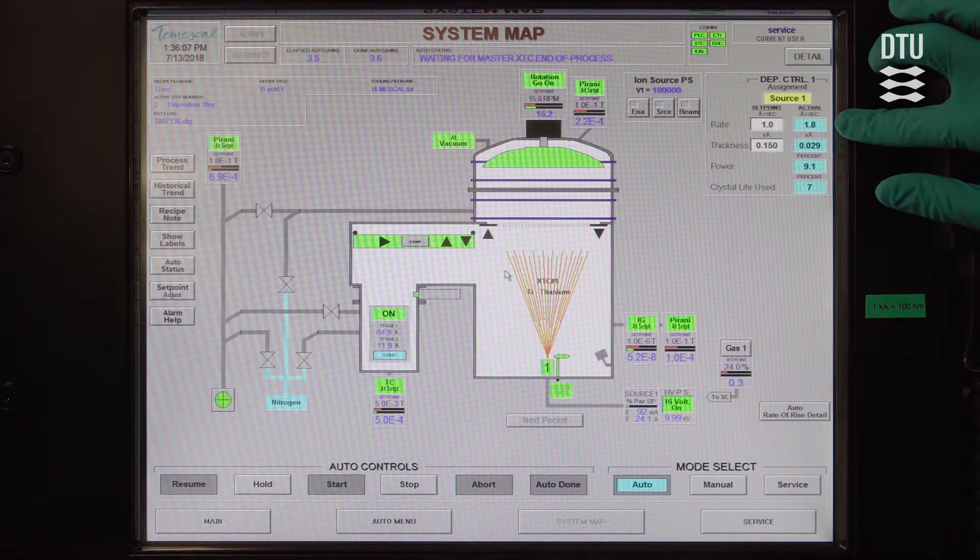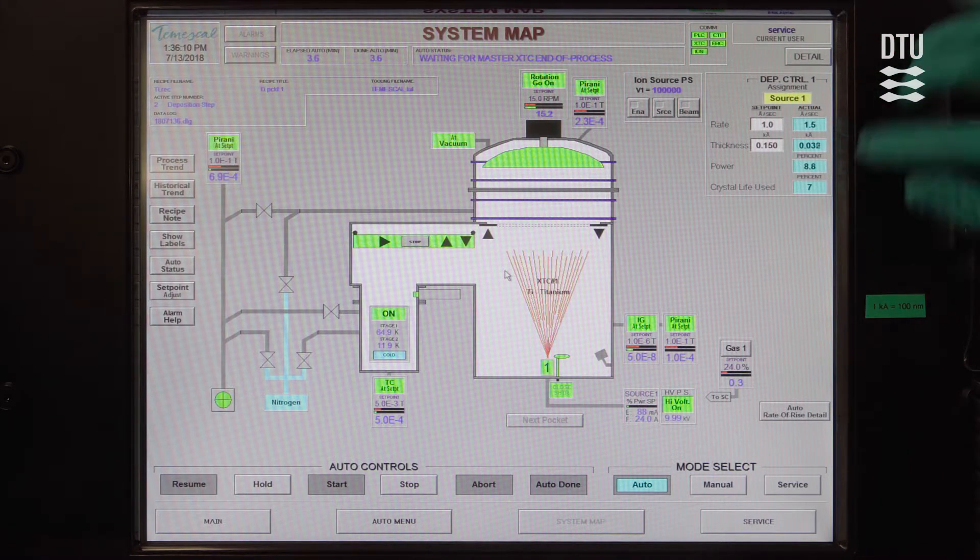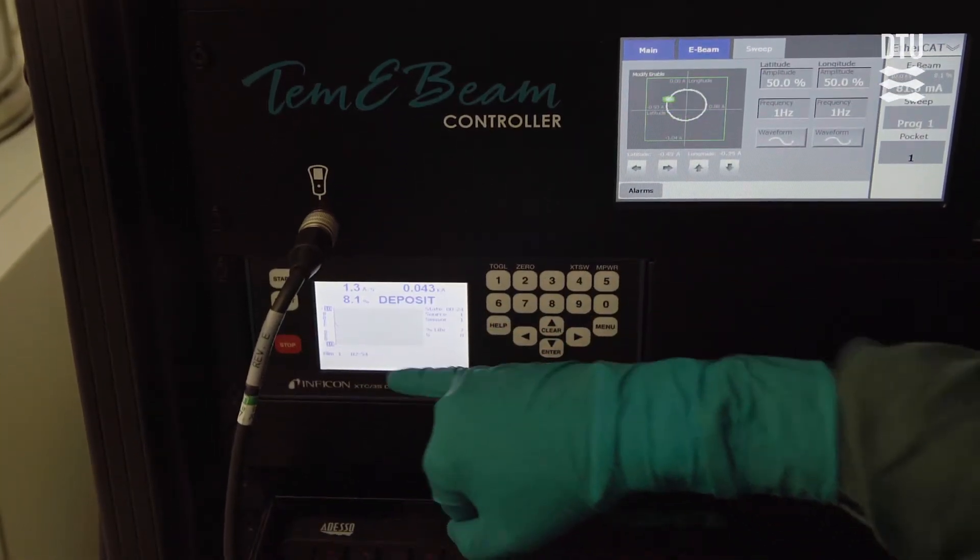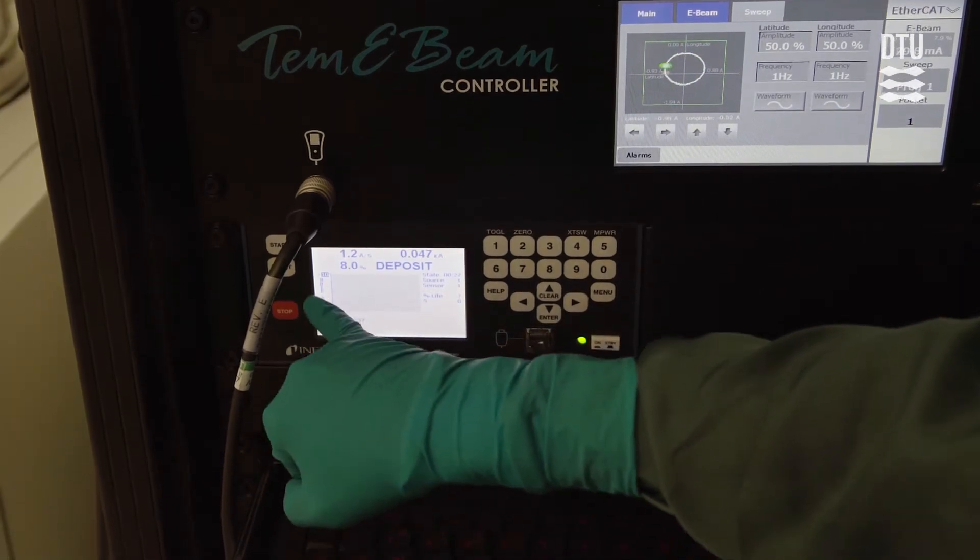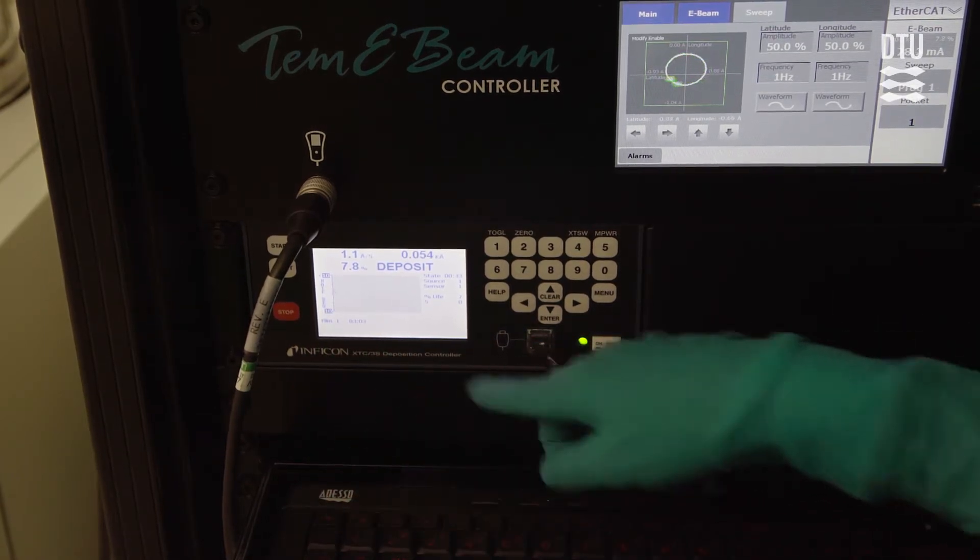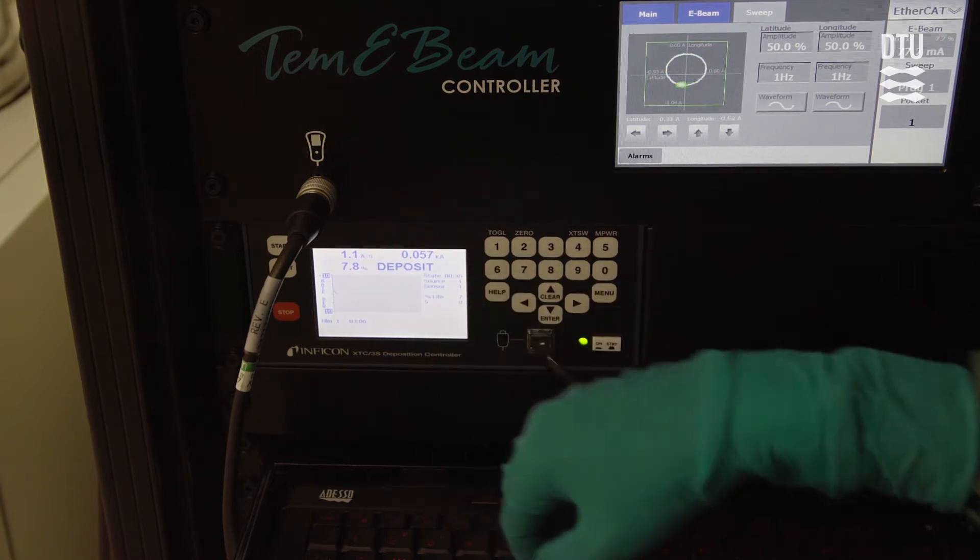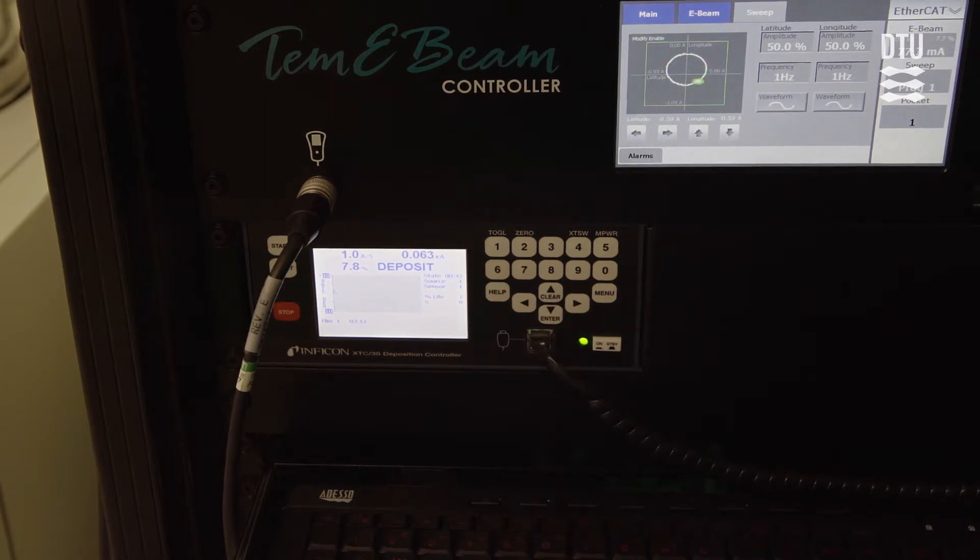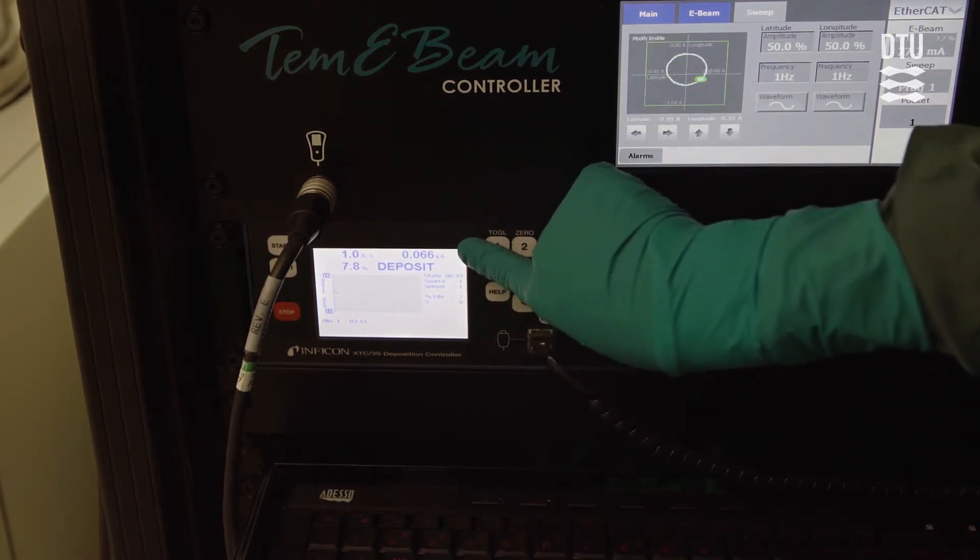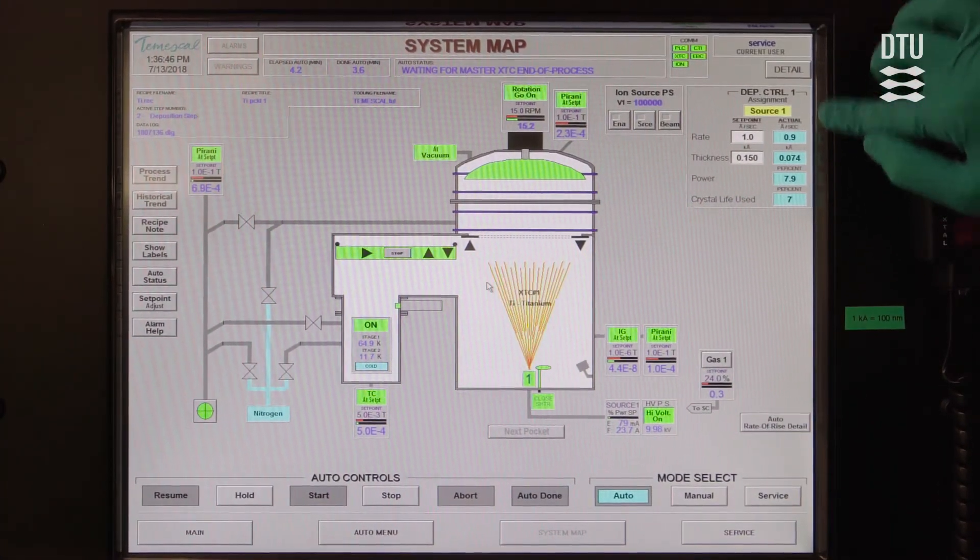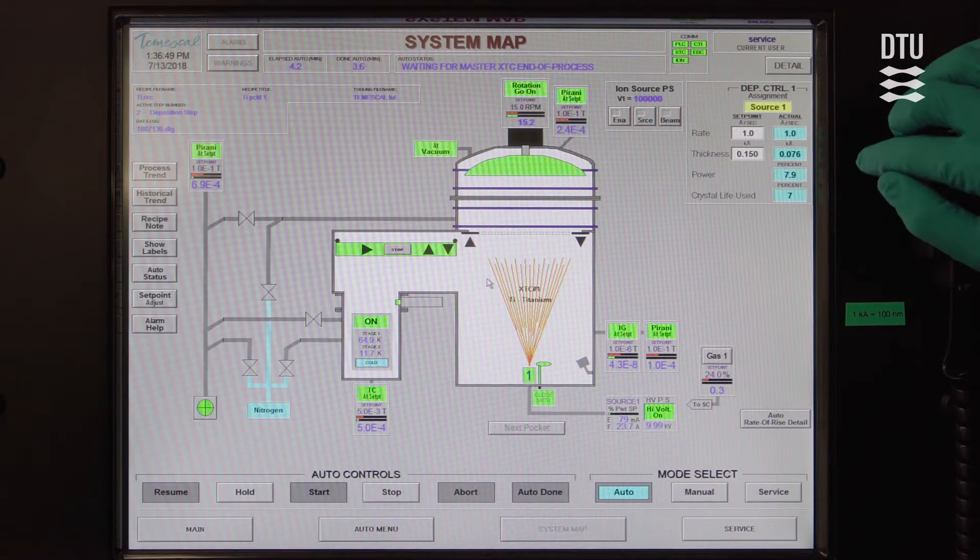You can also see what's happening to the deposition rates and you see that both up here on the right but also in the window for the crystal controller where you can also see the deviation of the rate from what you set. So you can see that we started out with a slightly too high deposition rate and now the machine is adjusting the power, it's lowering the power a bit so that we get a deposition at the rate that we asked for originally. You can also see how thick the actual film is and you can see that both here in the crystal controller and also in the deposition control window in the top right part of the system map.